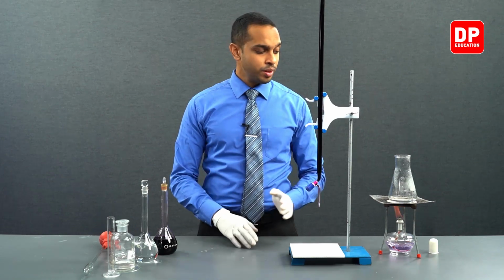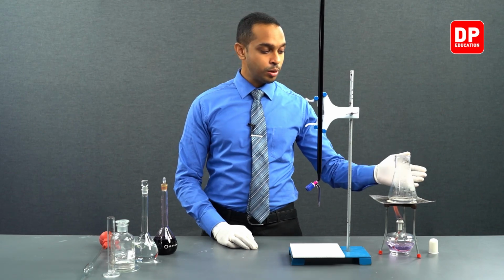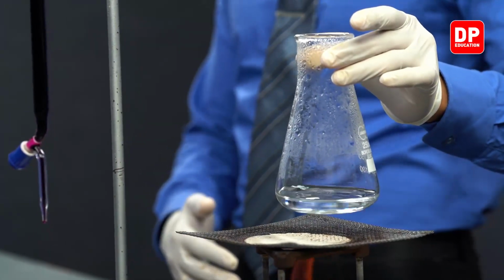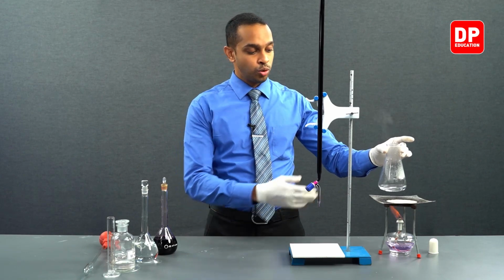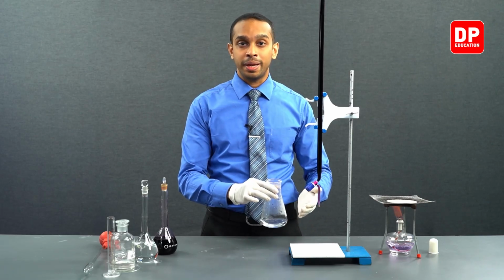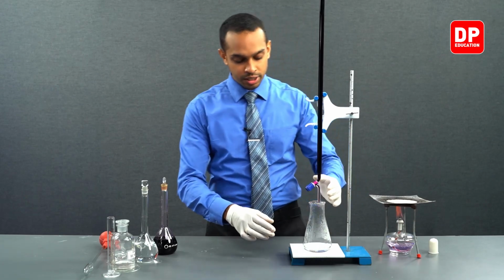As you can see, we started off with heating our solution in our titration flask. This was done because this reaction we are about to do progresses very slowly at room temperature. So by heating it up, we make sure that the reaction takes place at a faster pace. So now let's start our titration.